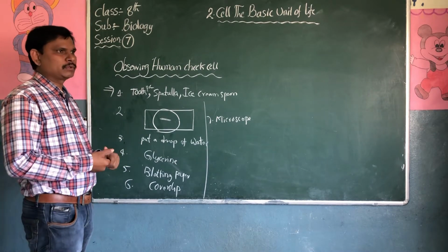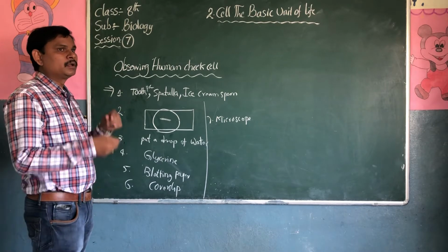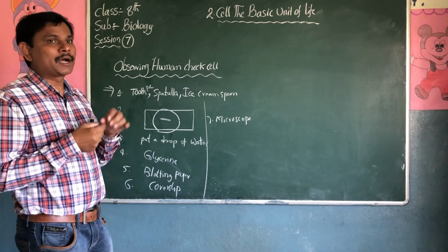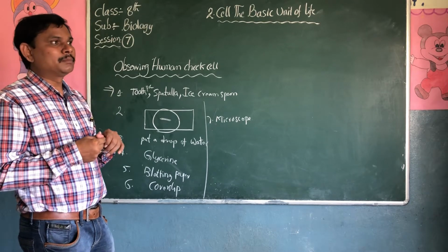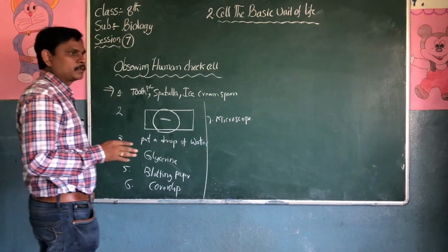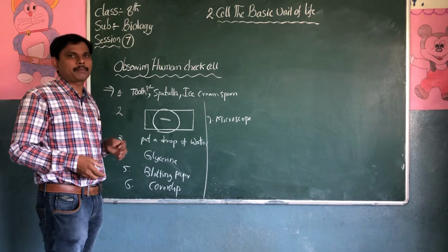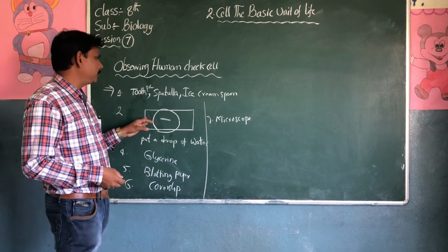Observe under the microscope. What precautions should we take while doing this experiment? Do not scrape the material hard from the inner mouth, because it will damage our inner mouth lining and blood will come from the mouth. That's why we are not supposed to do this on our own. We should remove the excess water present in the material by applying blotting paper, and we can apply tissue paper also to absorb the water present in the material.